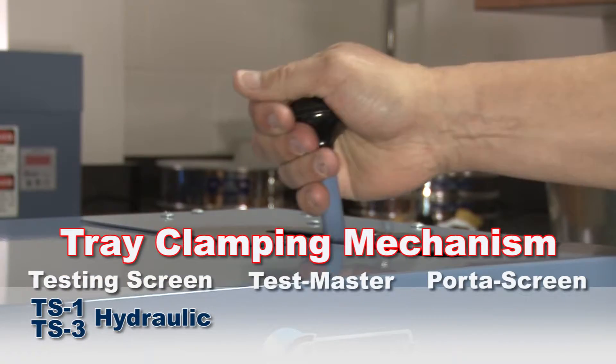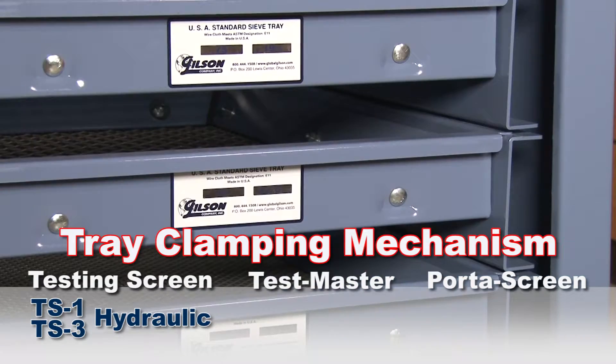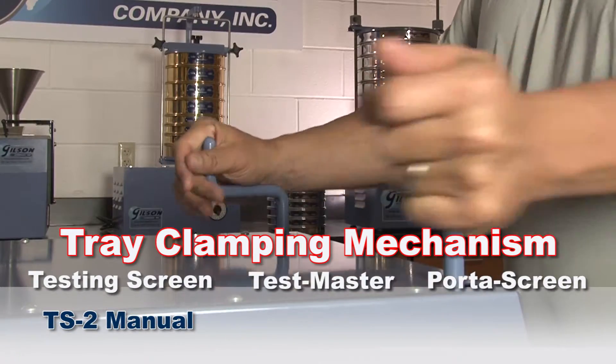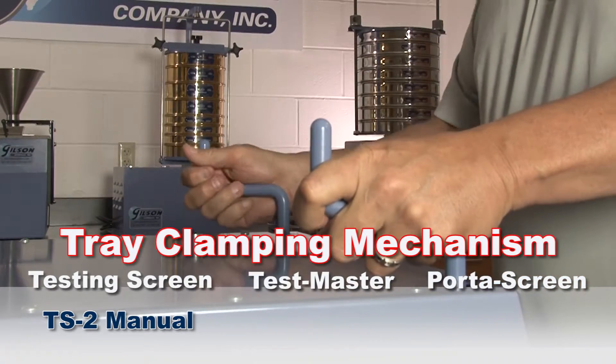The TS1 and TS3 have a quick-acting hydraulic clamping mechanism, and with a few strokes of the hydraulic pump handle, the screen trays are effortlessly secured and ready for testing. Whereas the TS2 has a mechanical clamping mechanism which secures screen trays with a few rotations of the dual clamping rods.